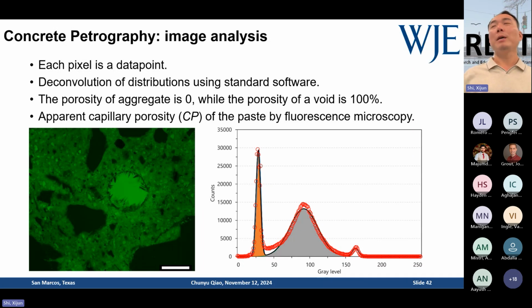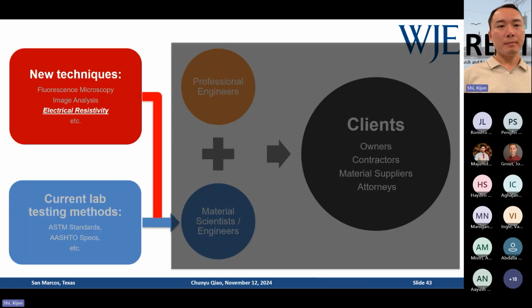Again, using those three peaks, we can probably quantify the relative capillary porosity, or microstructure per se, within your cementitious materials. So if you have different systems, you can compare whether the middle peak is lower or higher. I will showcase that next.